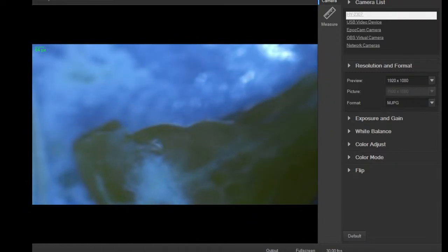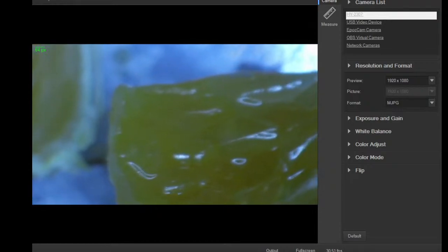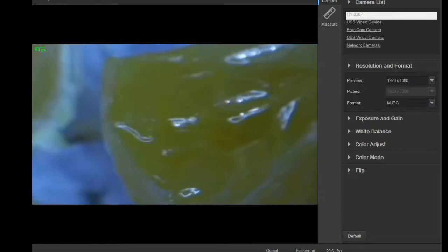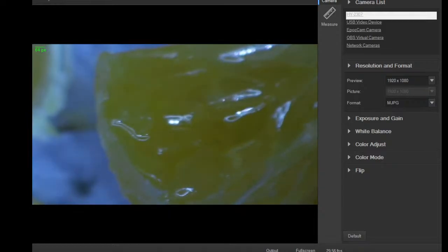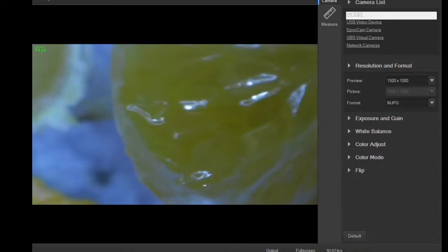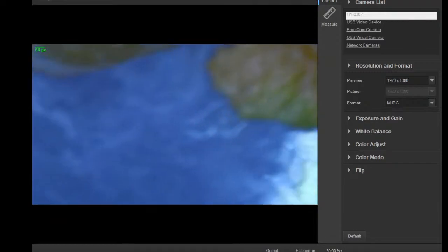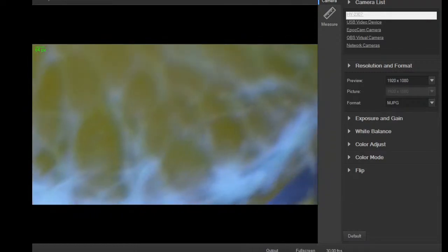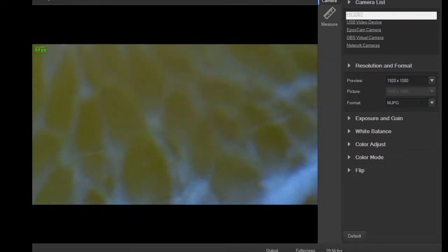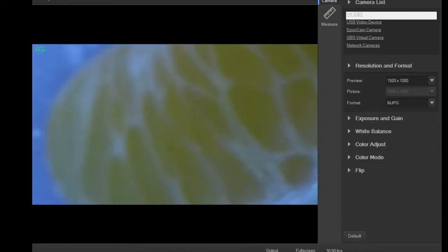This one I kind of bit into. You can see the individual sections there. Try a different light, that one's the wrong angle, I think. If you look, you can see the individual sections there, little compartments. And then the outside, of course, there's a whole segment. You can see the venation. It's so big I can't zoom out to the whole thing. Just like the leaves, you have this nice venation pattern.